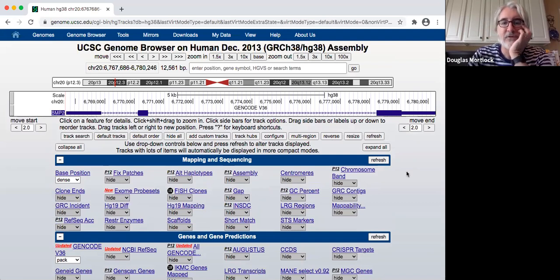All right. So we're back to showing the description of the BMP2 gene here. It's got 3 exons, and it's a not particularly big or complicated looking gene. So this is why I'm showing this one to you first, right? Now, I want to tweak the display on the browser because I think this font is too small, and I'm getting older, my eyes are terrible. I need to see this a little bit more clearly.